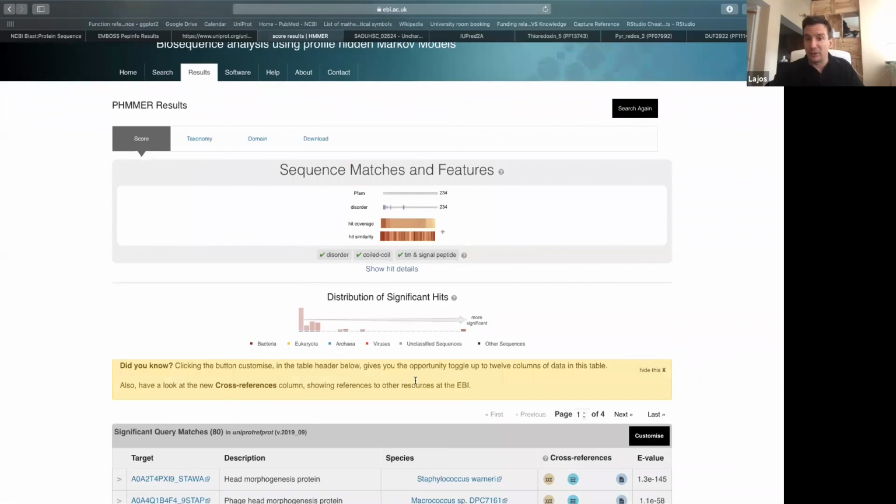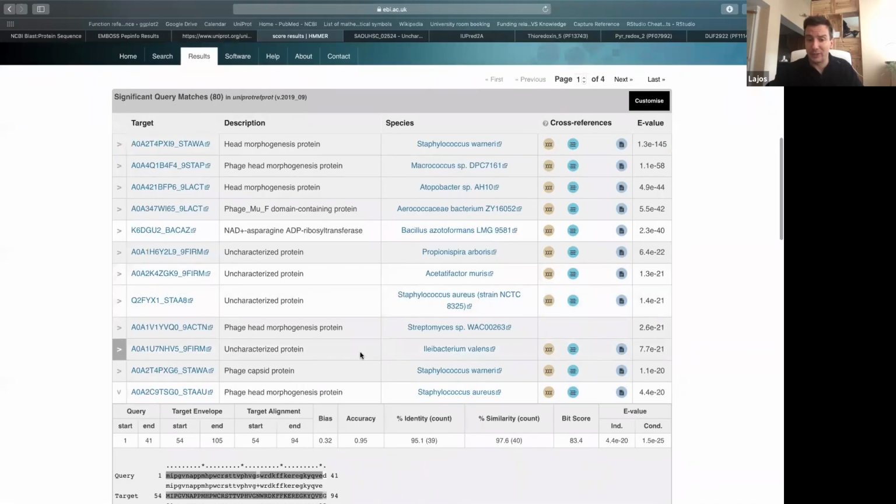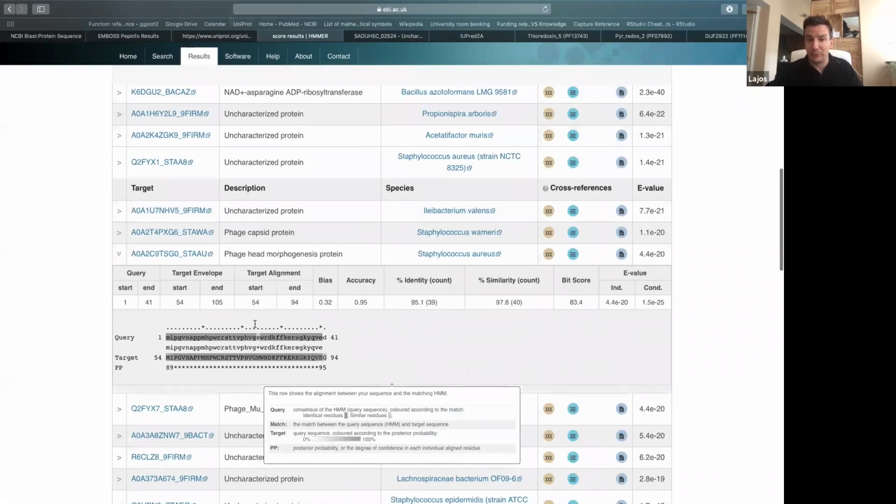in other organisms. If you look at this region here, clearly the first part is responsible for the protein-protein interaction, because there are these disordered patches there. So I can imagine that you will find the same kind of sequence somewhere else, but in a shorter form. I would try to go with the first 100 amino acids.